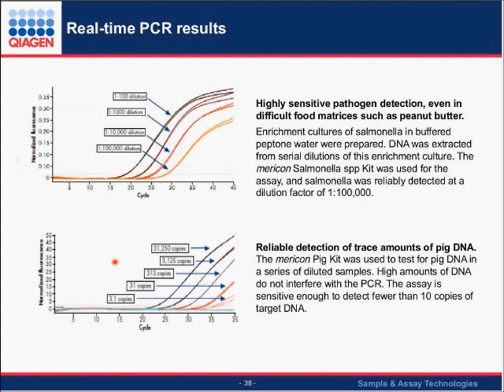Again, we talked a little bit about the desires of halal and kosher food manufacturers to make sure that there's no pig present in your foodstuff.